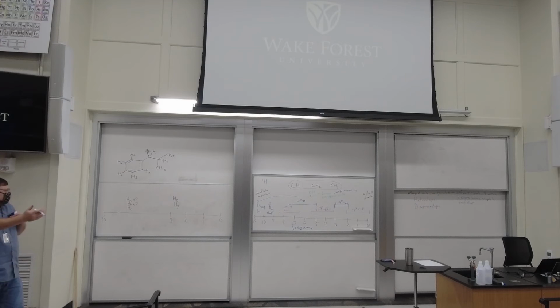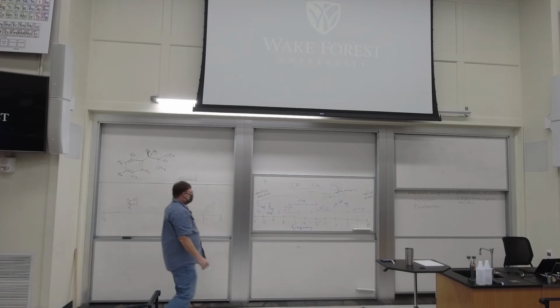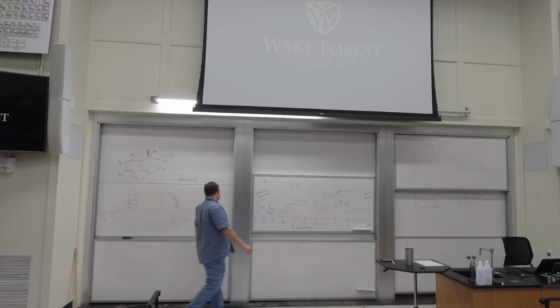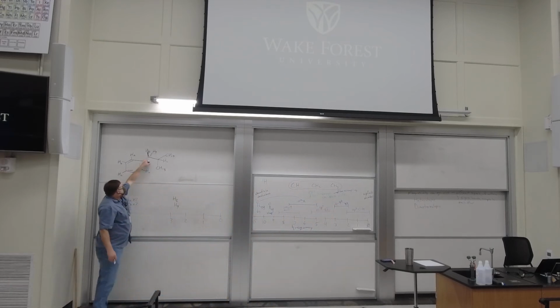So CH3s are, why did you think CH3? That's sp3, right? So all of those are sp3. So F and G are on an sp3 carbon, and that sp3 carbon's bonded to an sp2 carbon.